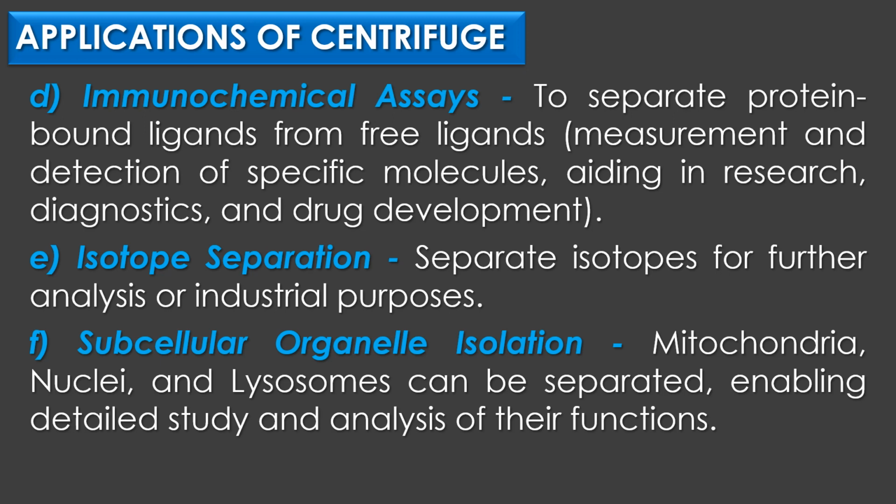The fourth application of centrifuge is immunochemical assays. Centrifuges are utilized in immunochemical assays to separate protein-bound ligands from free ligands. This separation enables accurate measurement and detection of specific molecules, aiding in research, diagnostic, and drug development.